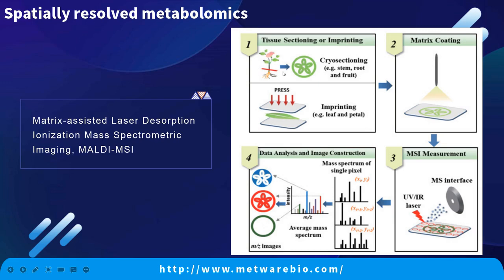First, you need to get biological samples. Then, the samples are supposed to get a preliminary treatment, sectioning. Second, we spray matrix on conductive glass after slice processing. So here's the question, what's the use of spraying matrix? It is mainly used to coat the metabolites on the surface of the samples. Now comes to the third step.